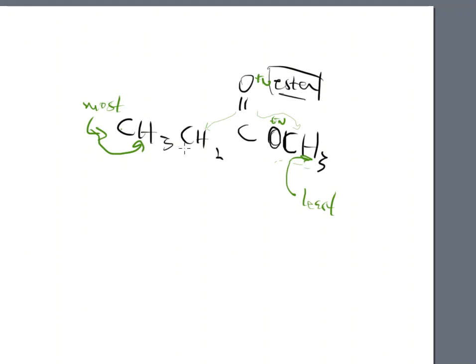It's HNMR, not carbon NMR, but HNMR. All right. So look at the number of electronegative groups, and of course the hydrogens that are nearest the most amount of electronegative atoms will be the culprit, and they will be the one that gets bullied. So that's just how it's going to happen, folks. There's nobody in there to stop it unless you want to start being part of that mess too.